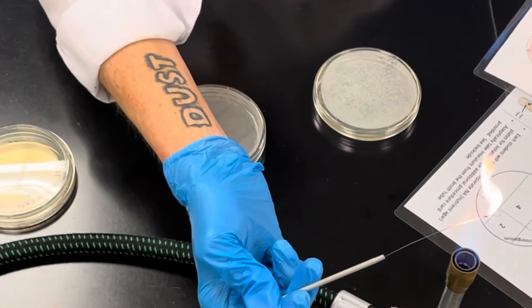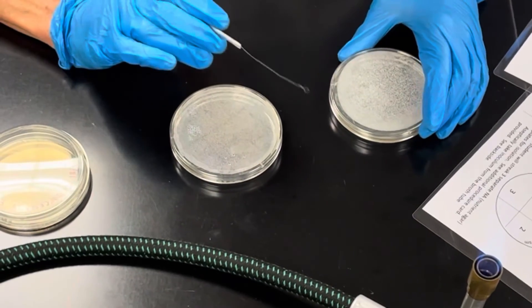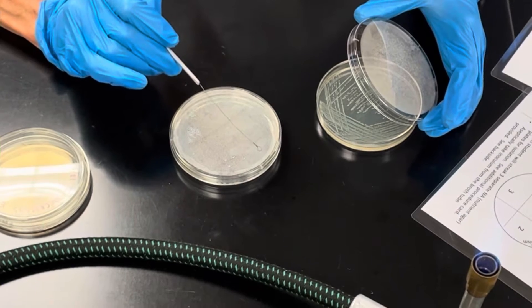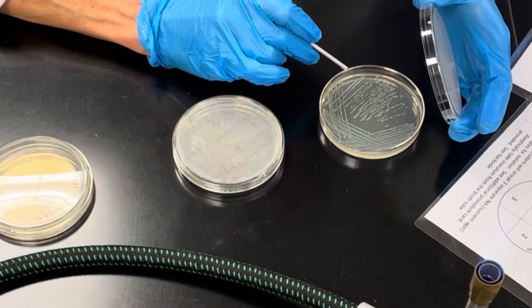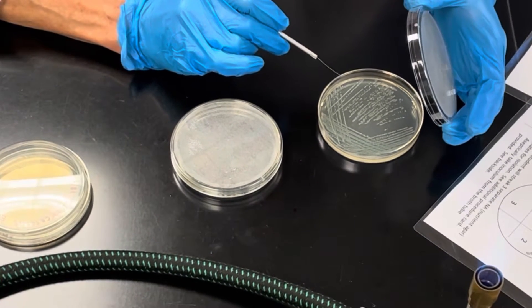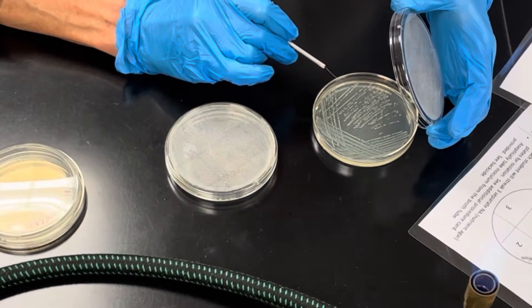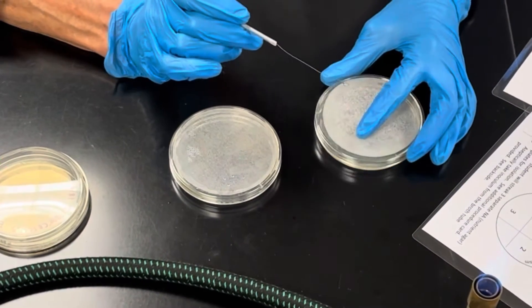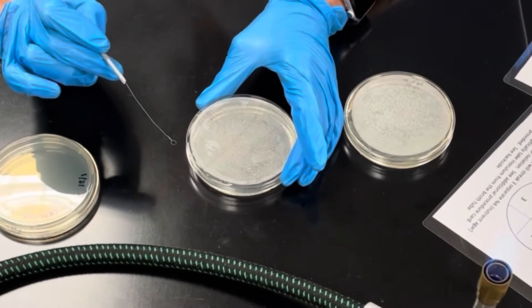Once the loop is very hot, find a spot on the plate that doesn't have any bacteria — that's a great place to cool off your loop. If you want a pure culture, you take your bacteria from a single isolated colony. You only need to take a little bit.